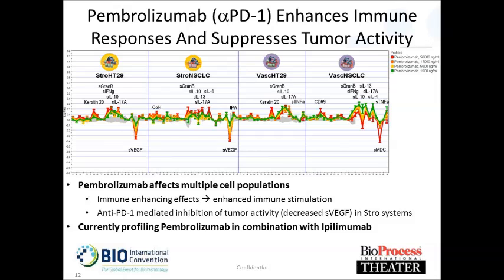And what we can see, consistent with what's seen clinically, is increases in biomarkers that reflect inflammatory or immune responses, right? Increases in granzyme B, interferon gamma, IL-10, IL-17, etc. Interestingly, in the fibroblast-containing systems, inhibition of VEGF seems to be a specific biomarker for tumor cells, which we are developing. But the same thing overall is seen in the endothelial cell containing system, increases or potentiation in inflammatory or immune responses. Right? And certainly these systems are amenable to combination studies, right? So combinations of checkpoint antibodies, companies with small molecules developing those, looking to see their suitability in combination with these checkpoint antibodies as well.